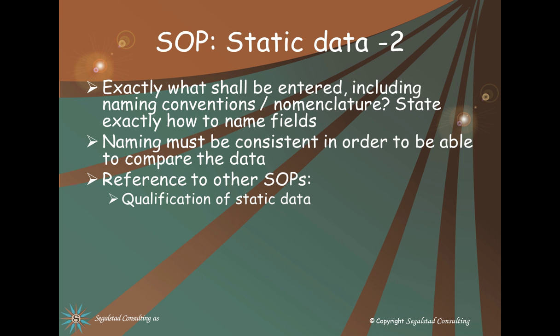So I said exactly what shall be entered, including naming conventions and nomenclature. State exactly how to name these fields. The naming must be consistent in order to be able to compare the data.